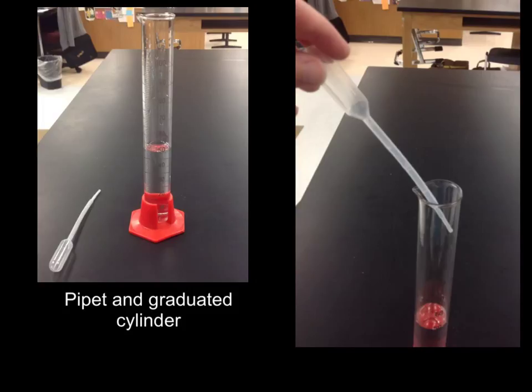You also could use a plastic disposable pipette, and the pipette is really just used for making drops of liquid, so if you want to get that exact volume, you can use the pipette to add your liquid to your graduated cylinder.